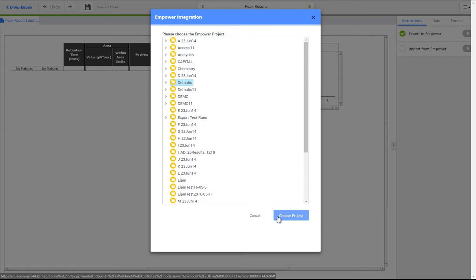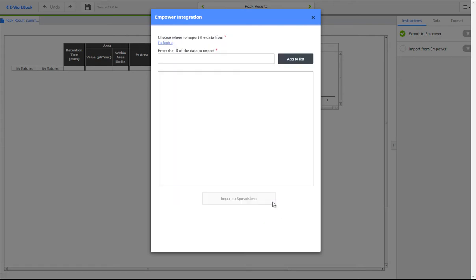The results to retrieve are identified by their mPower IDs. Both result IDs and result set IDs can be used to identify the data to return.